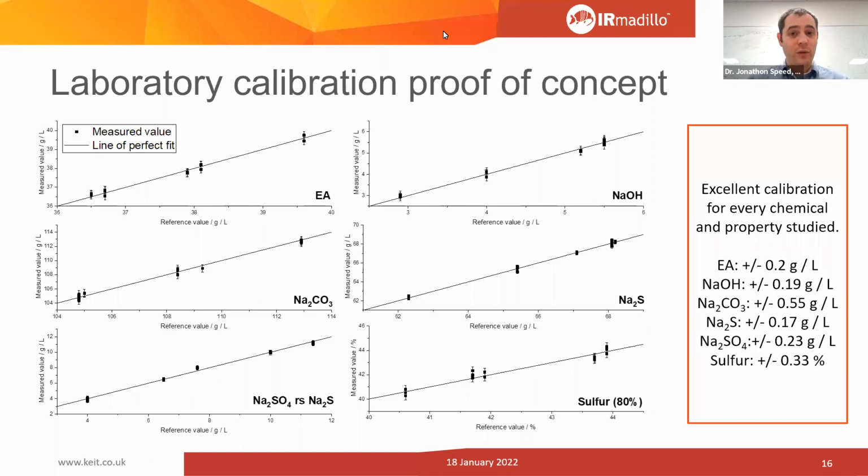It was very quickly removed with hydrochloric acid. It was easy to wash off, that's not a problem. And we were able to alert, you now need to do this. And part of what we want to install moving forwards for customers is this alert. It's effectively a 1 if the spectrometer is happy, it thinks it's measuring what it should be, there's no problem, and it flags up an alert and it gives you a 0, or the other way around, saying, I have a problem, you need to take action.